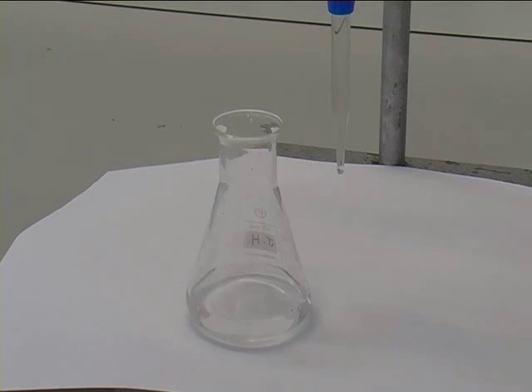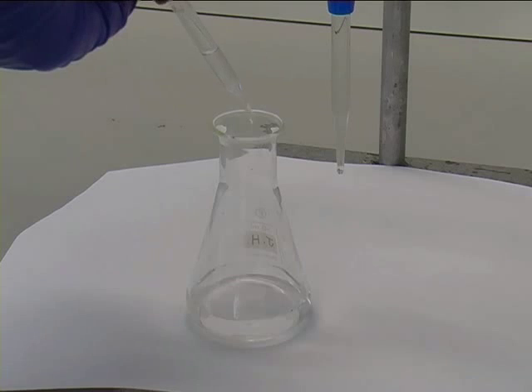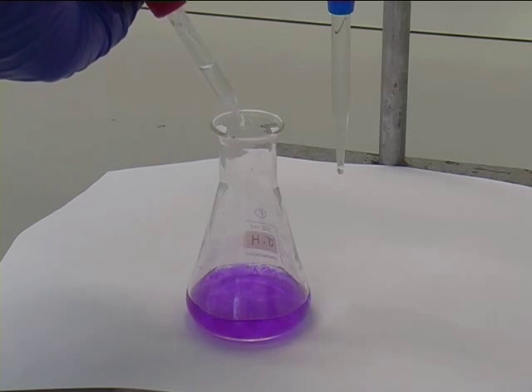Measure out a precise volume of your unknown concentration solution and add an indicator. In this case, phenolphthalein is used.